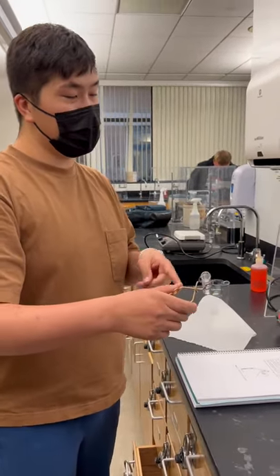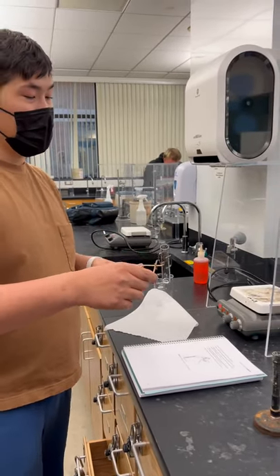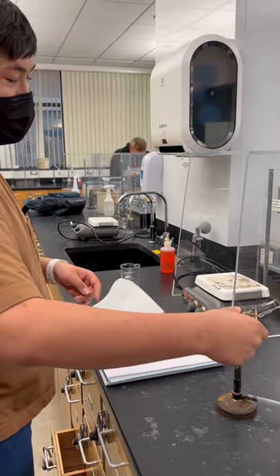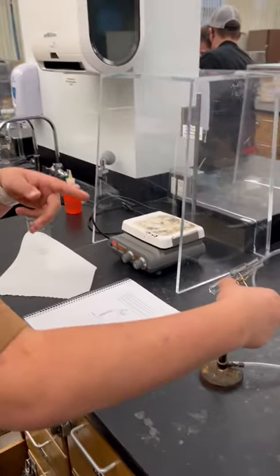We're going to heat up the test tube using the Bunsen burner. What you do is take it using the clamp, and then hold it over the Bunsen burner at an angle away from people, so that we don't get the fumes towards you or anybody else.